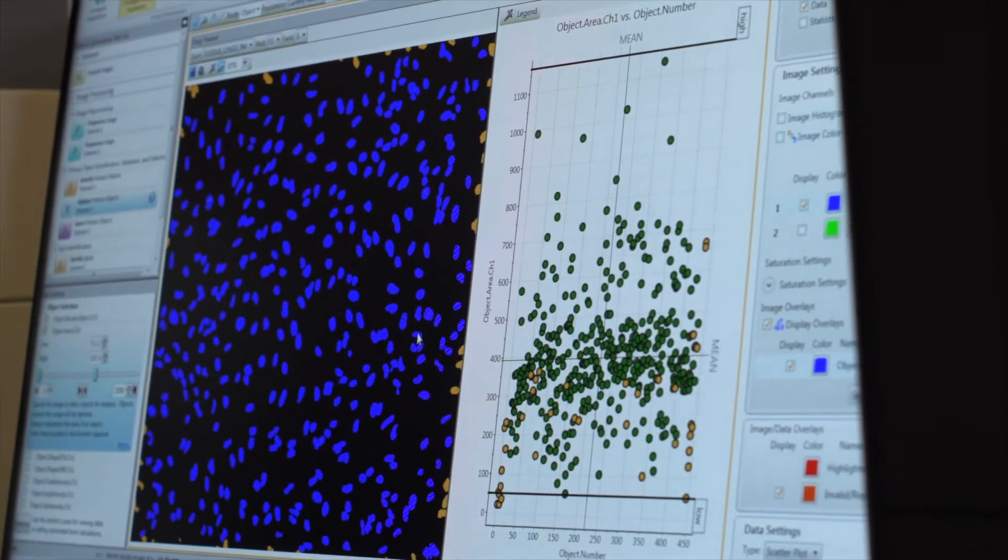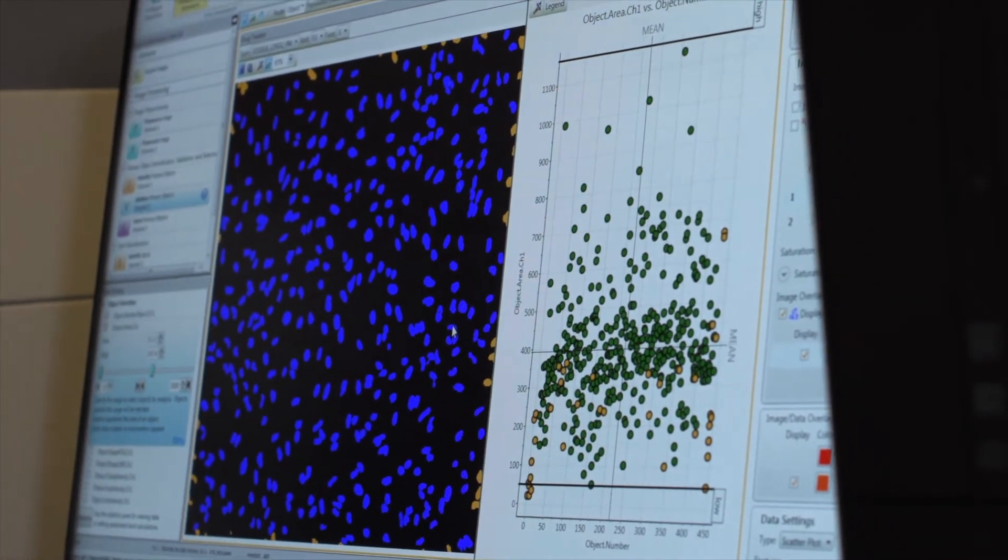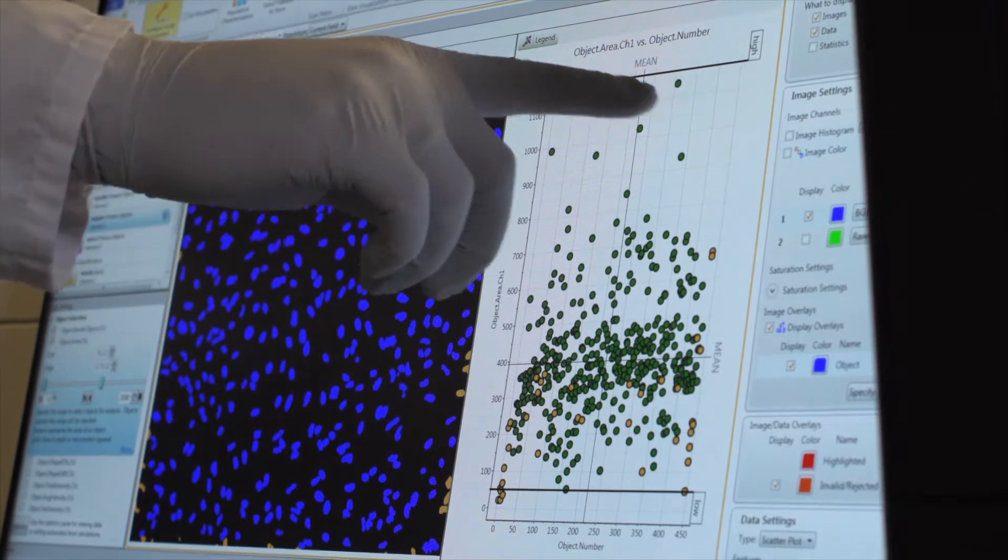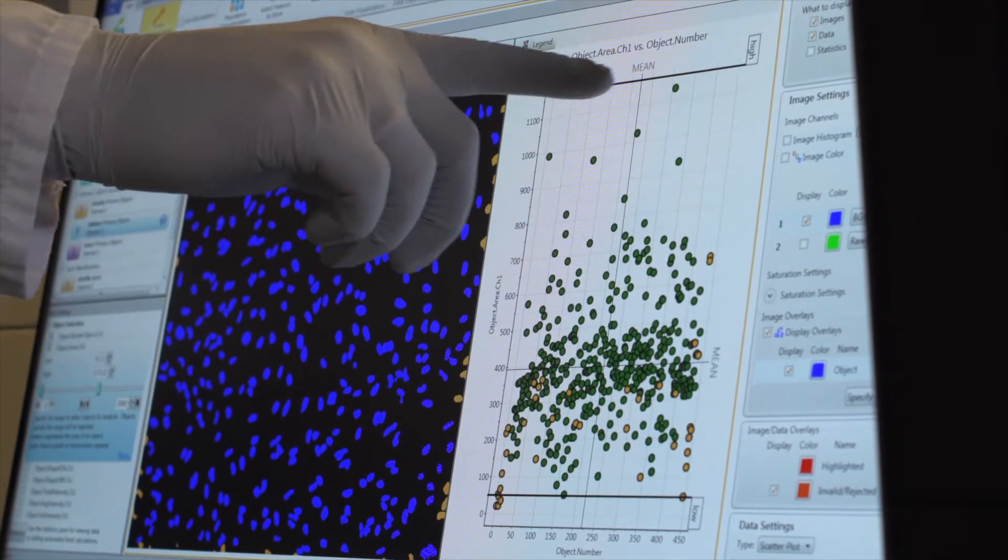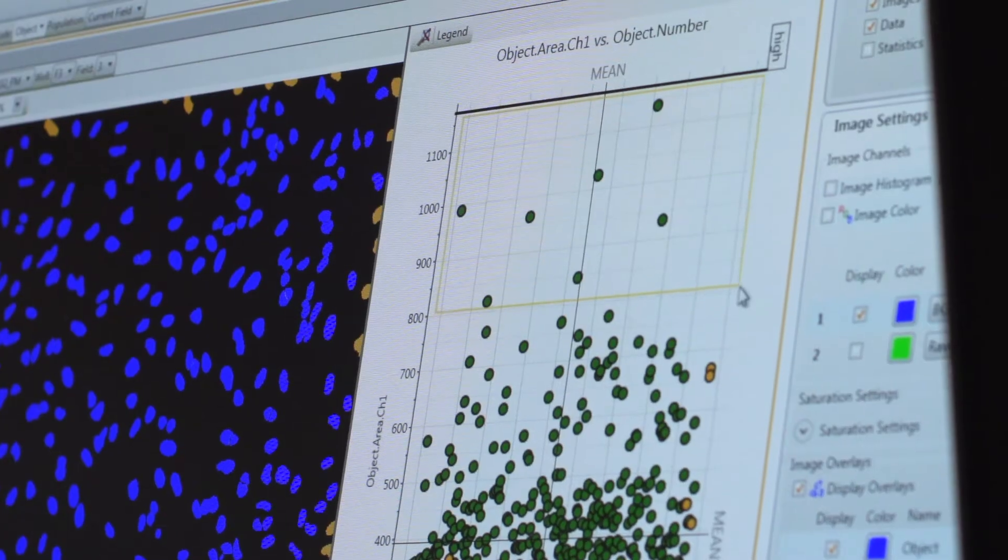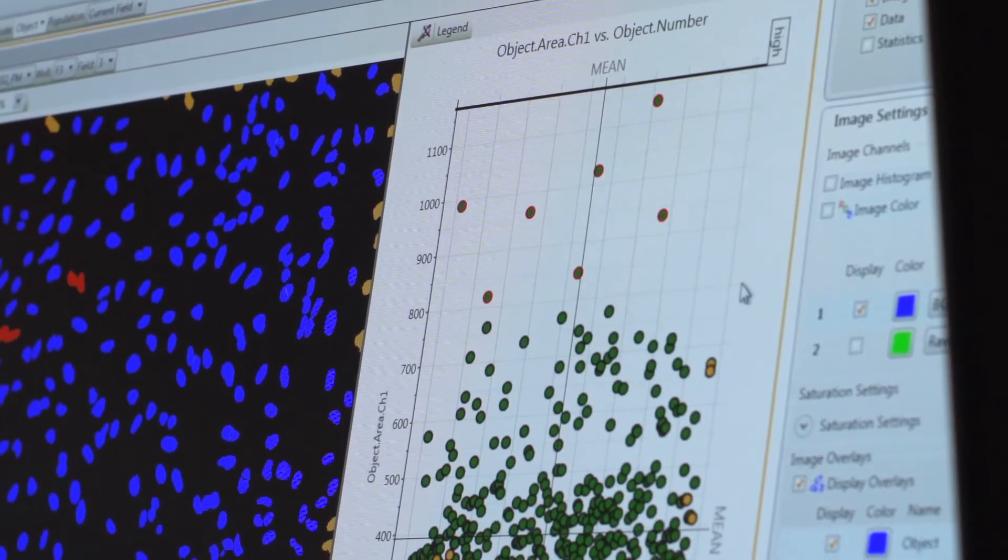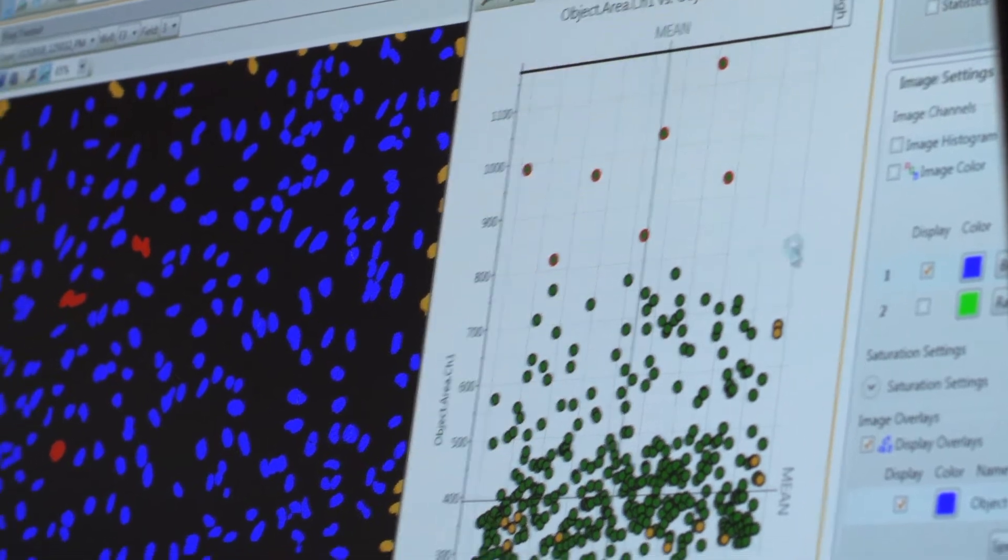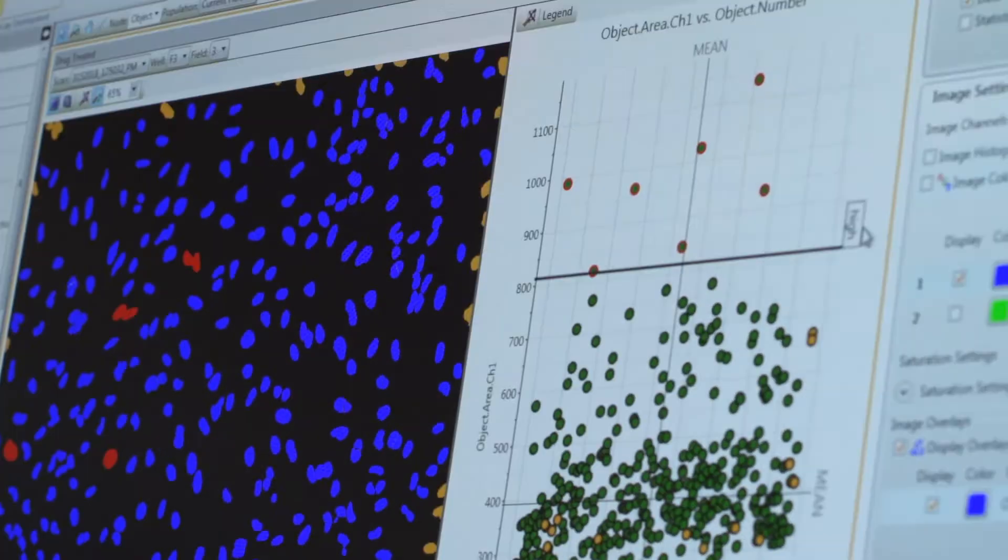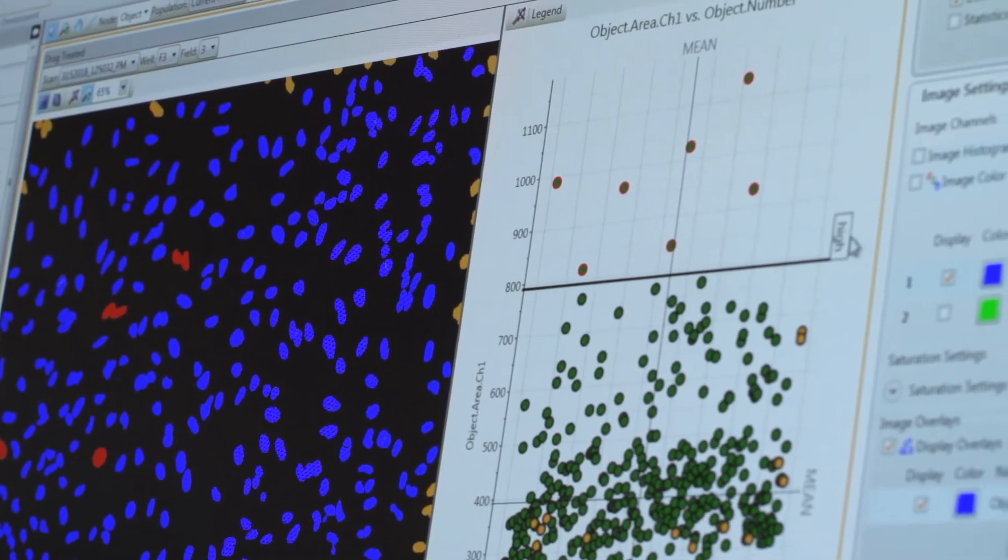Every cell has a story. Images and data are tied at the cell level, which allows you to find out what the data for each cell looks like. It's like flow cytometry, except that you can now also see what your cell looks like.